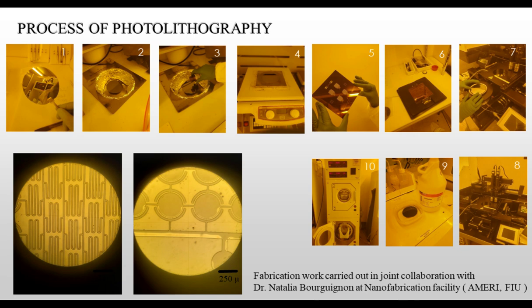After this step, the mask is selected. Steps 6 and 7 are aligning of the mask using a mask aligner. In step 8, UV is exposed. And finally, in step 10, the exposed surface is washed. Finally, we have the desired geometry on the wafer. Now this acts as a mold, and PDMS is added on the wafer, which is allowed to cure, and the microfluidic chip is peeled.